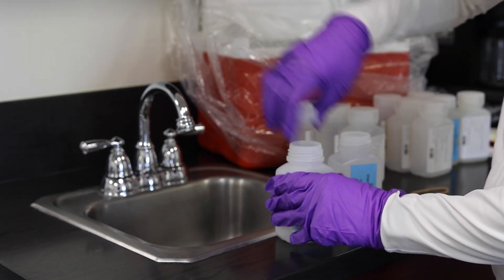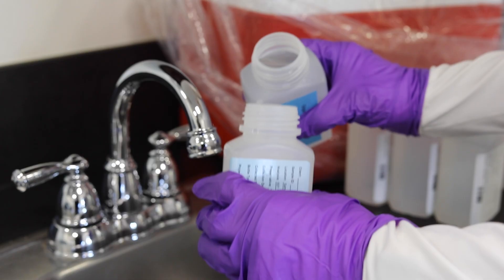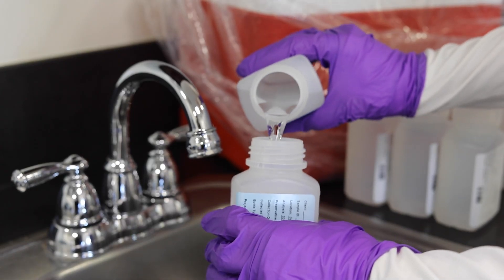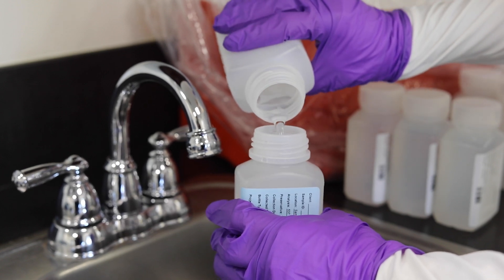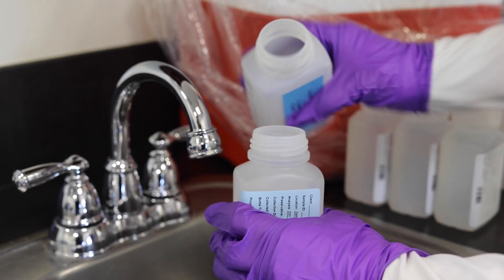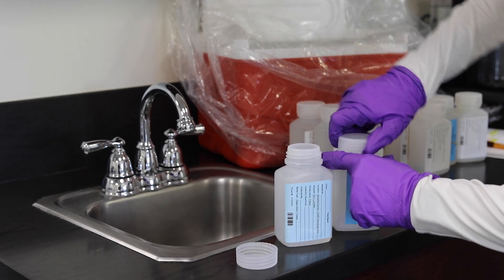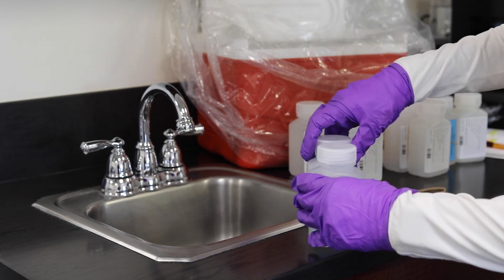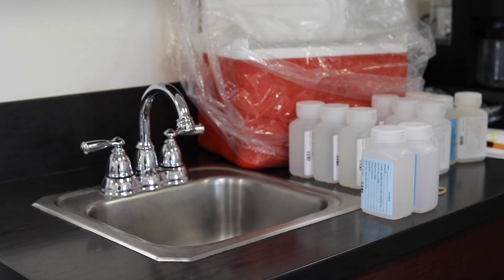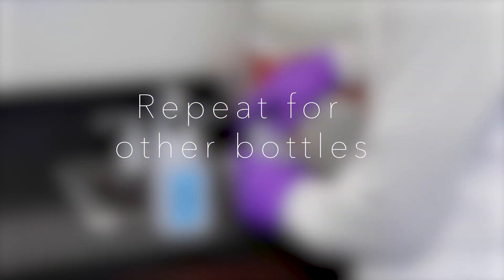Locate the field reagent blank bottle and the unpreserved reagent water, both joined by a rubber band. There will be a set for both PFAS methods. Open both containers and proceed to transfer the contents of the unpreserved reagent water container into the field reagent blank bottle. Field blanks must be listed on the chain of custody form. Both the empty reagent water container and the filled field reagent water container must be returned to the laboratory.